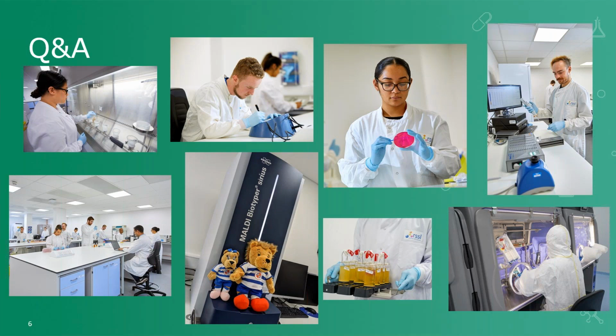Okay. And I have a question from Kim, and she said, what would you recommend to clean with between cleaning agents and sporicides, water for injection or a neutral detergent?